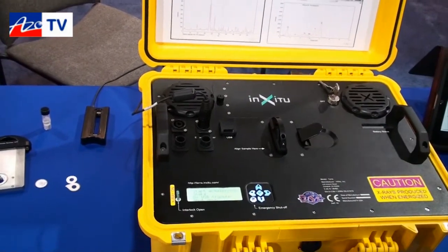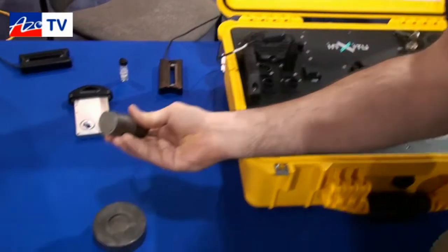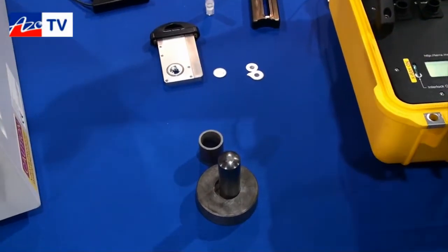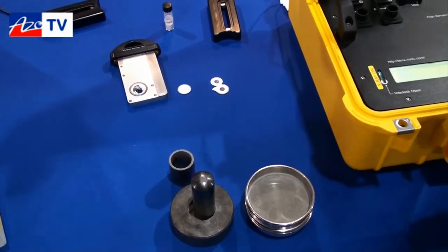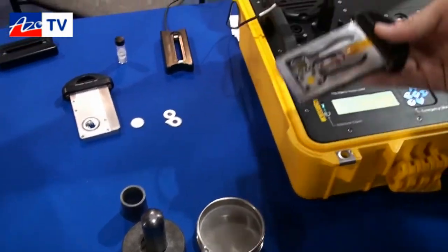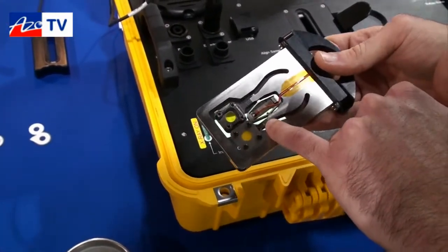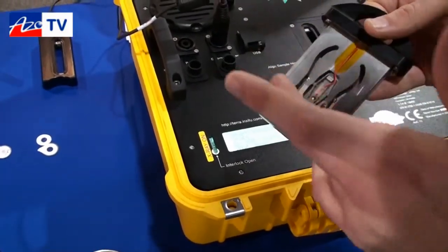As far as sample preparation goes in the field, you take a rock sample of any kind, crush it down, and sieve it out to 100 mesh. Once you have that loose powder, you can take it and load it into the sample holding device. You load a little bit of powder — about 15 milligrams. It will fall down between some mylar windows and move around inside.